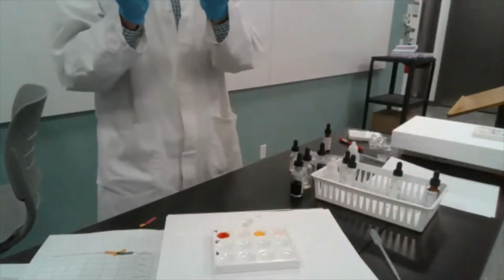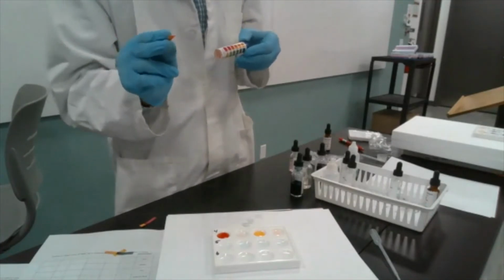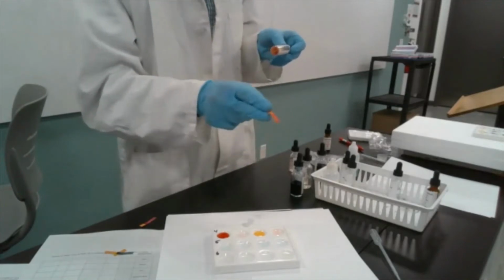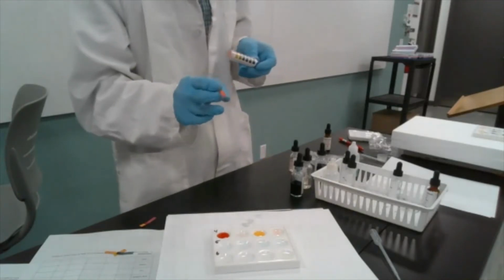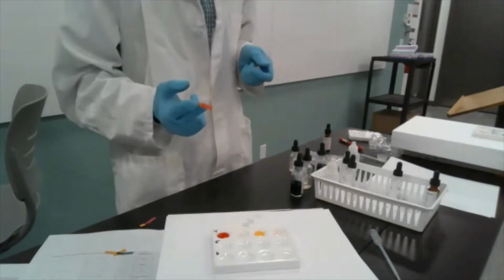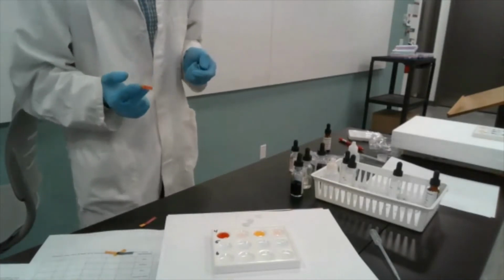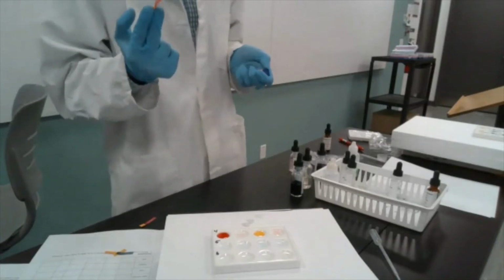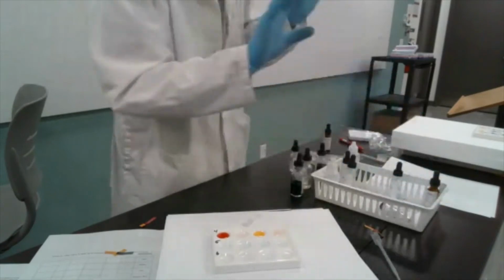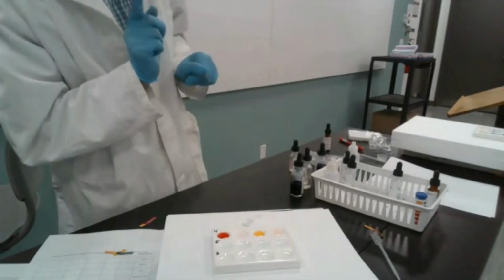So you see that we had 1 for hydrochloric acid, and we have pH 3 for our grapefruit juice. So pH 3 is quite a bit away from 7, which is neutral. And now you probably know why you can't really drink grapefruit juice sometimes undiluted, because it's so acidic, right? Depending on the cultivar. Exactly.